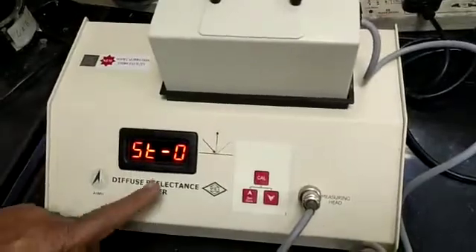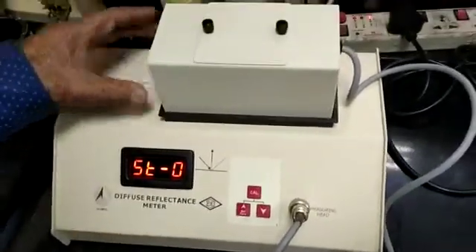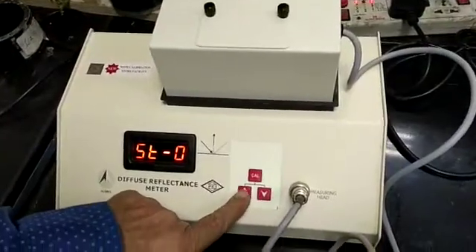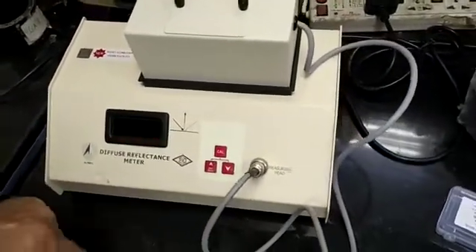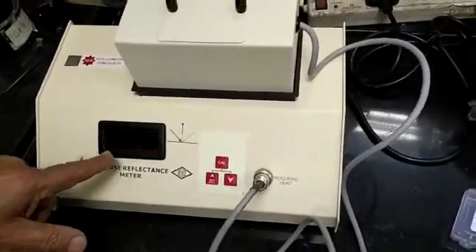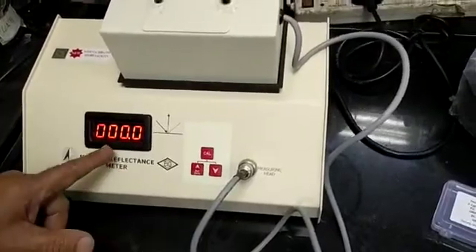After switching on, this is the reading. After setting, you press 0. It will start blinking. Wait for a few minutes. Zero comes.